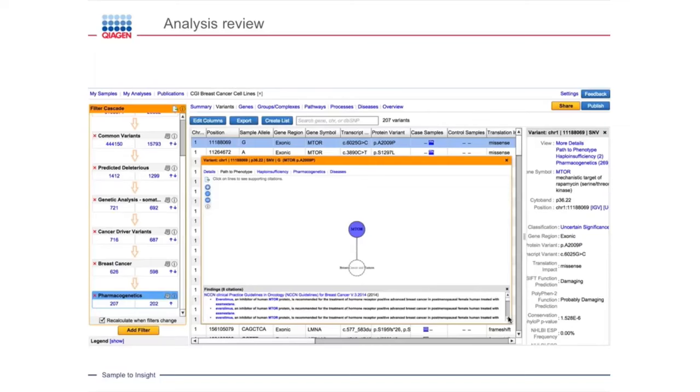If I had selected one or two hops and I had some novel variants that were not previously directly linked, I would see those genes connected to known genes and then connected to the disease. And similarly, by clicking on the connection links, I can find more information about those relationships and make informed decisions whether I'm now looking at a novel target, a novel gene that might be involved in this particular disease pathway, or if it's just a spurious association because this gene interacts with everything.